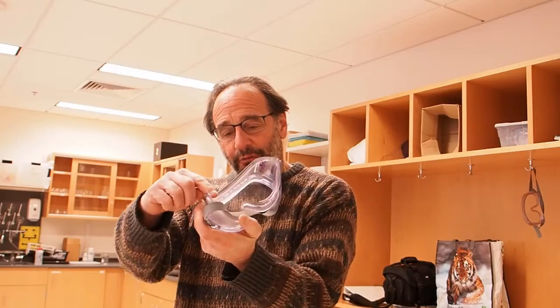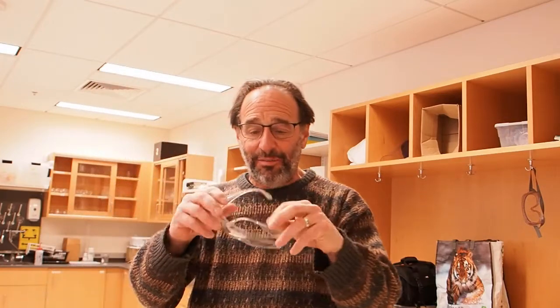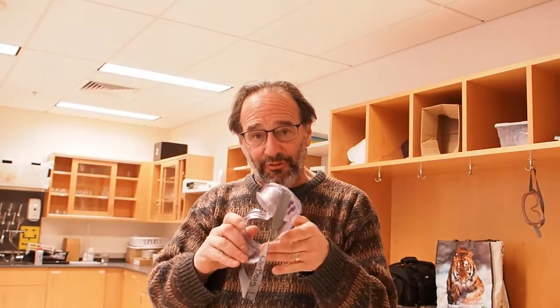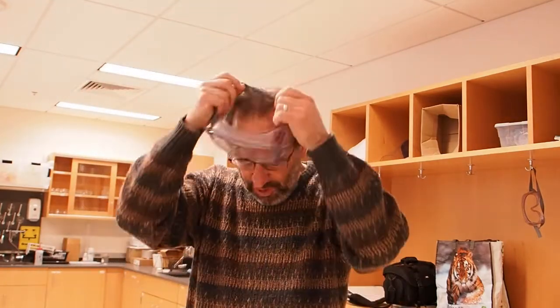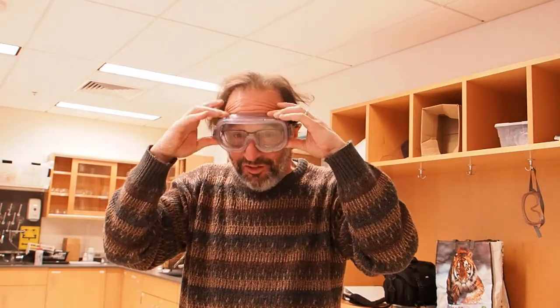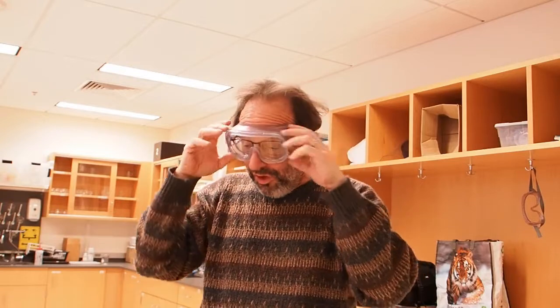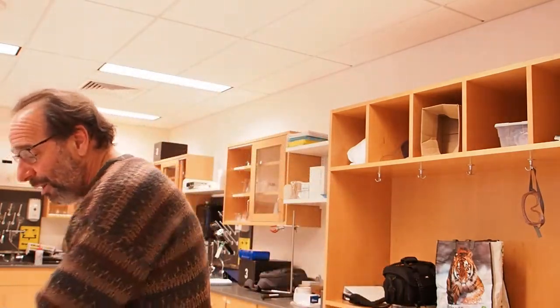These are fully sealing. And so what happens is, if I wear a pair of safety glasses like this and I put these on, there's a gap right here. So if something splashes on my forehead, it's going to drip right down to my eyes. And that is bad. So what we have instead is we have these fully sealing goggles, and you put those on, and those you'll feel seal all across your skin above and below your eyes. So these are the kind of goggles you need to be wearing, and those are the most important piece of safety attire that you'll have in lab. And you should put those on right around when you come into lab.